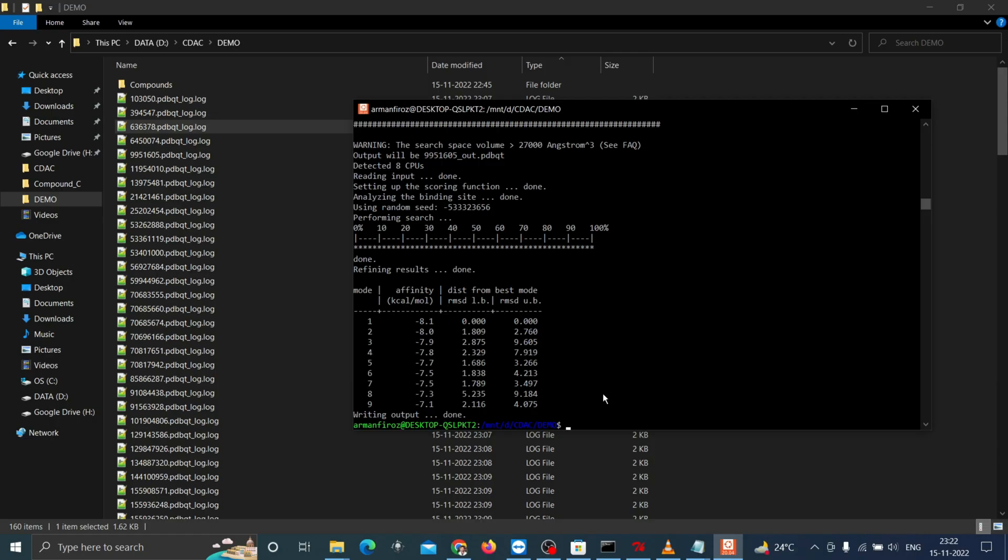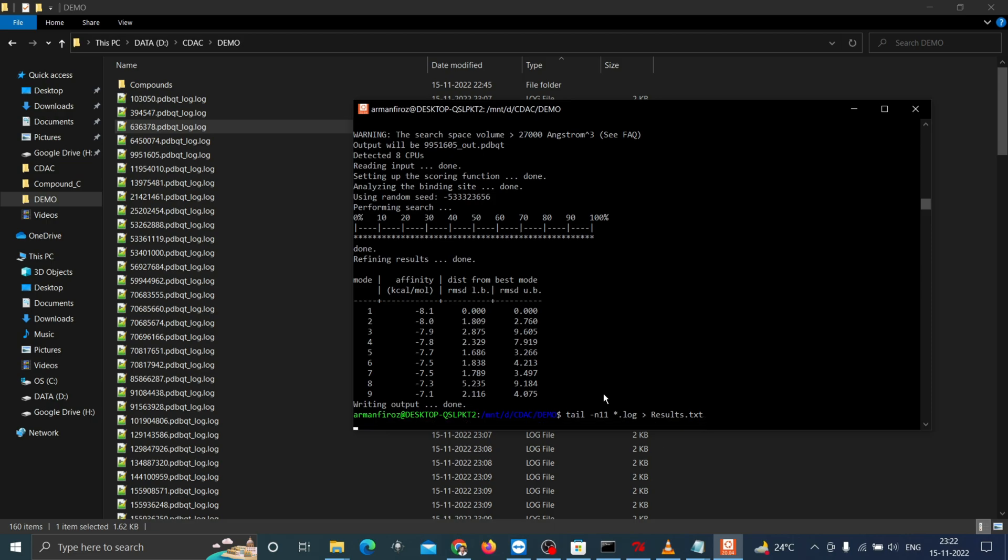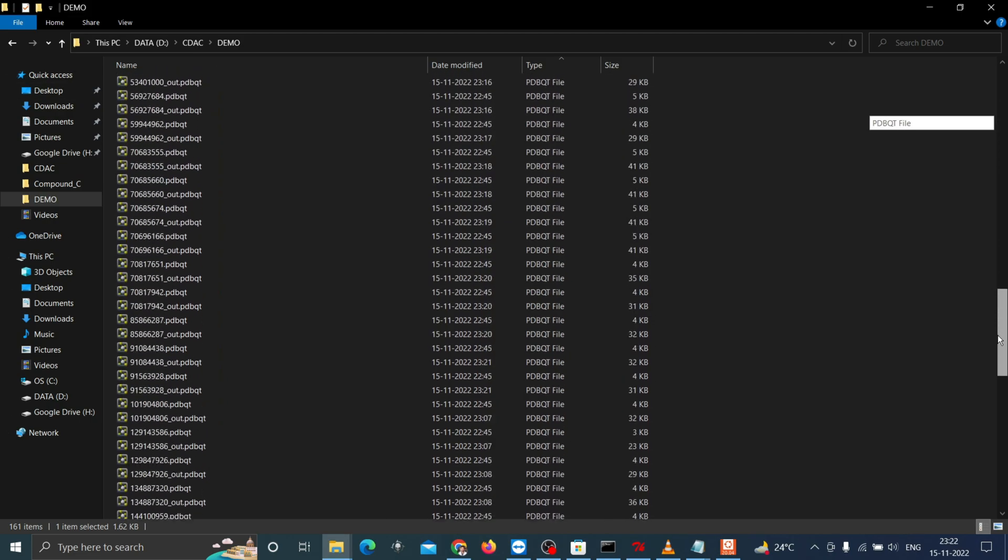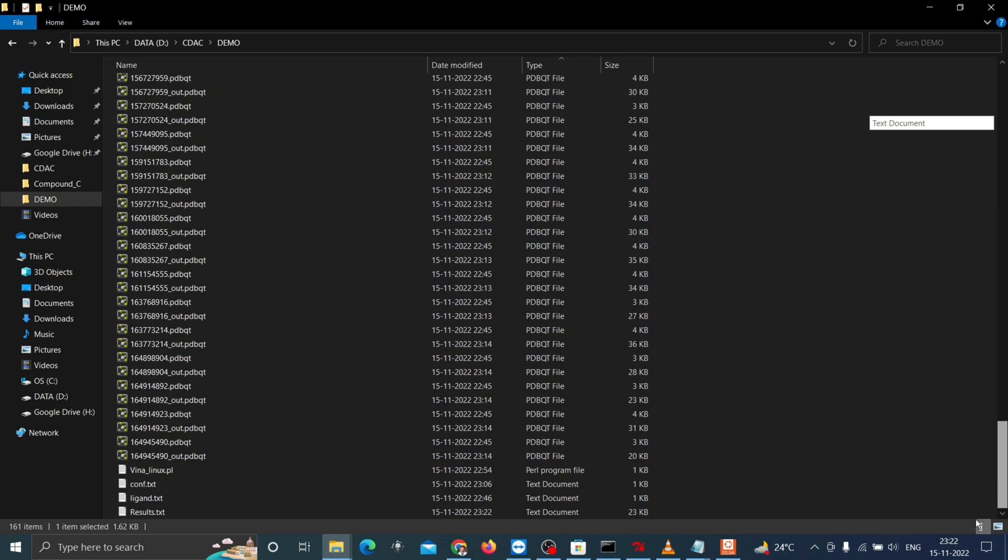Type tail -n 11 *.log > results.txt and press enter. This code is copying and compiling the last 10 to 11 lines from every log file into a text file called results.txt.